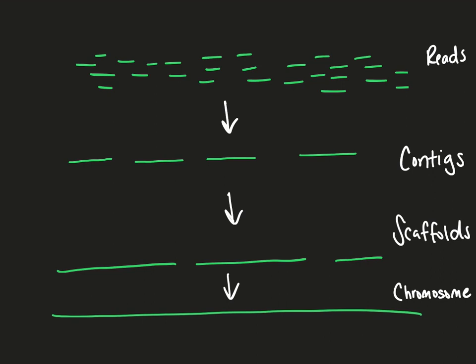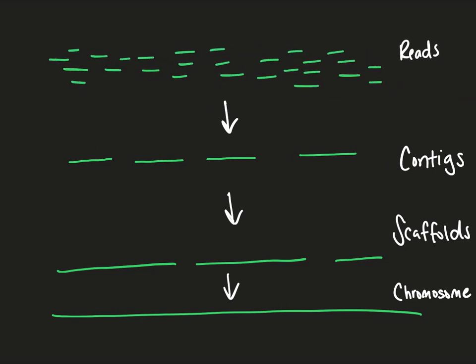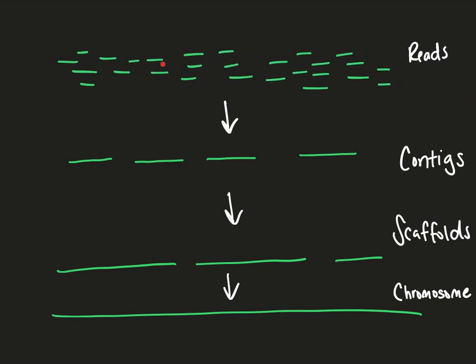Depending on what genome you're using, if you just don't have enough reads, you didn't get enough sequencing for your organism, you might find genomes that stop at the contig or scaffold level of assembly, and we're just working on it. When we're using the genome browser, we're going to see full chromosomes worth of information for humans and zebrafish and fruit flies. This is because lots and lots of people have been working on this for a long time. But don't be surprised if you're working on a less studied organism that your genome only has the assembly at the level of scaffolds or even just contigs.